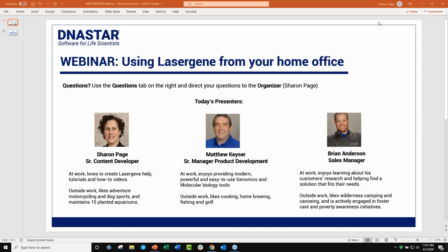We do realize that this might be your first experience installing Lasergene on your own, or maybe it's your first time using the latest version of Lasergene. There might be some applications that you've never seen before. So we wanted to hold this quick webinar to get you up and running.